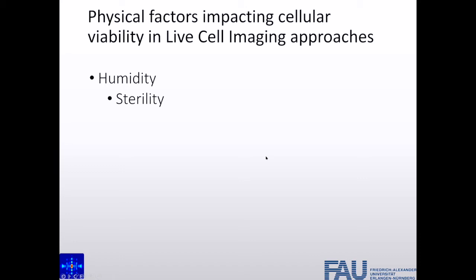A next really important factor for me as a cell biologist is sterility. As I already mentioned, we don't need a 2 million euro instrument when our cells are dying or suffering. I do all my research in the absence of antibiotics, so I quickly see contamination. It is something on microscopes that you really see when it happens, except mycoplasma, and this is what you can test with some other test kits.